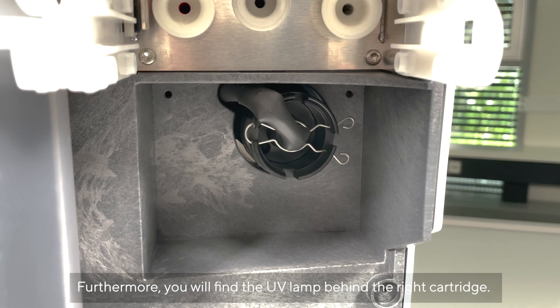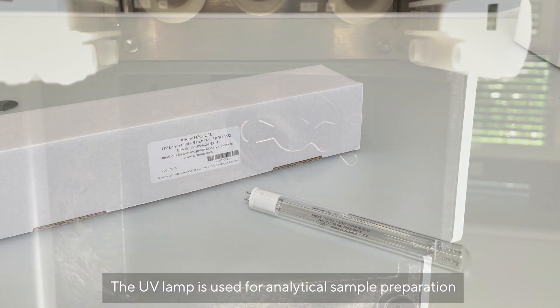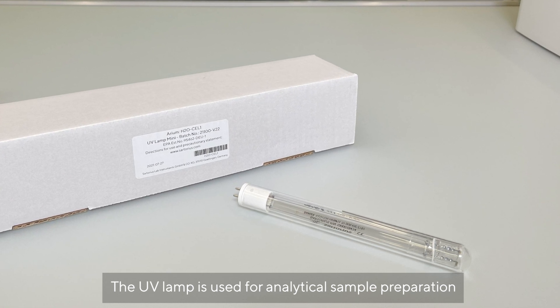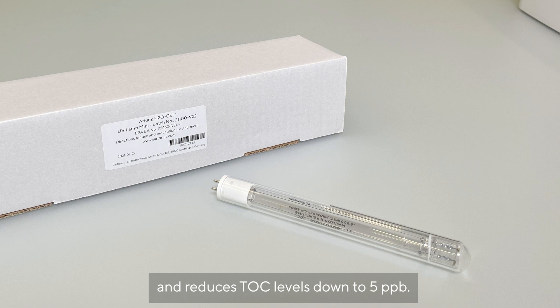Furthermore, you will find the UV lamp behind the right cartridge. The UV lamp is used for analytical sample preparation and reduces TOC levels down to 5 parts per billion.